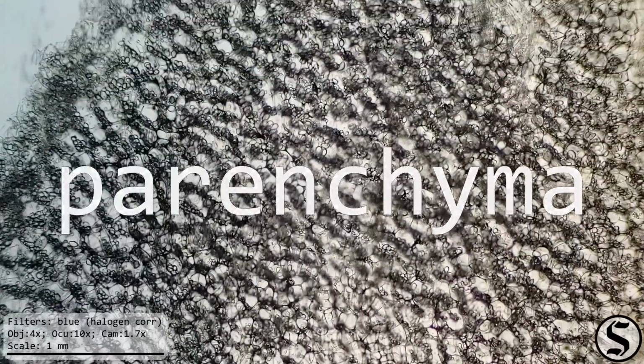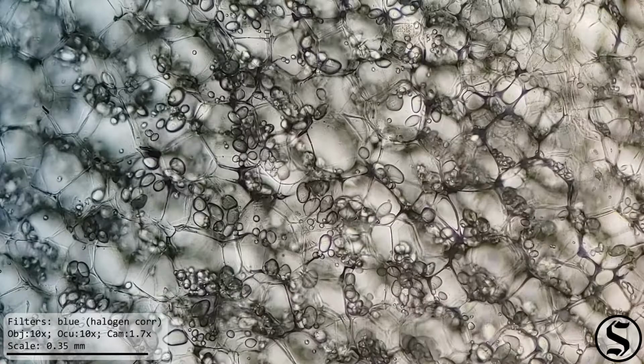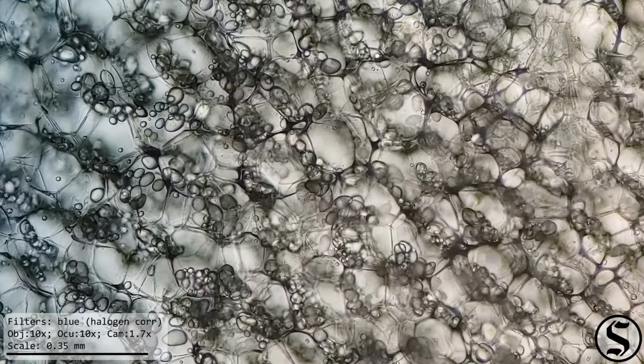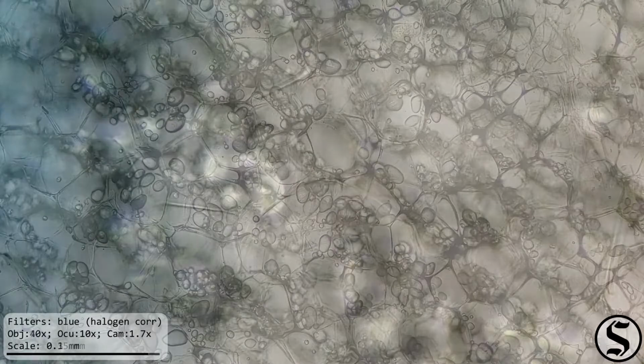Now we see the inner parenchyma of the potato, and there is a lot of starch in here. Starch is a Germanic word meaning stiff or hard, because you starch clothes to stiffen them up. It's basically a polymer of sugar, and it's less soluble in water than sugar is, and so it's a great way for the plant to store sugar in a relatively inert way until it needs it. And then when the plant needs that energy, it breaks it back down into sugars.